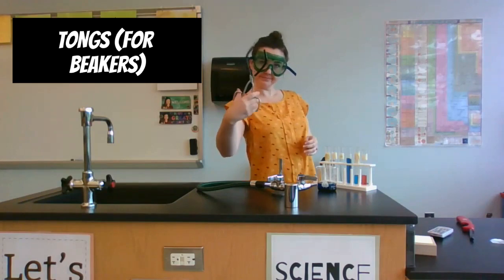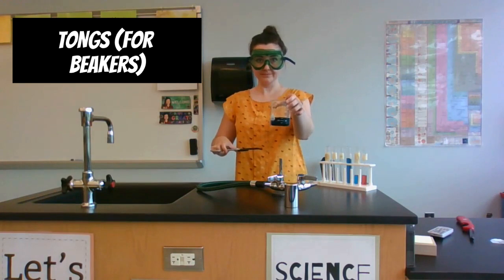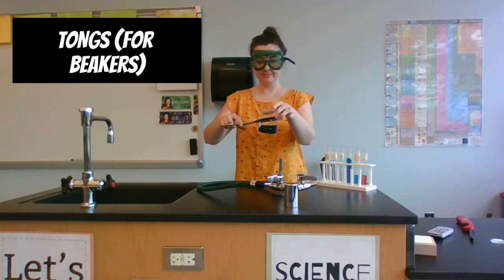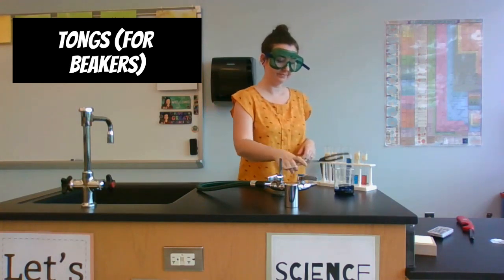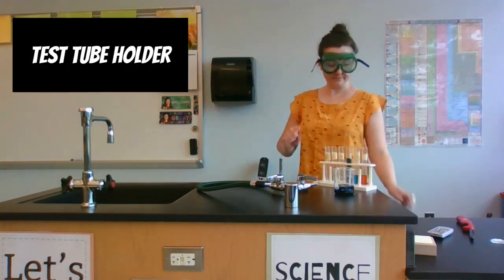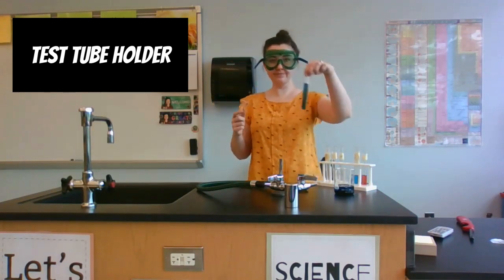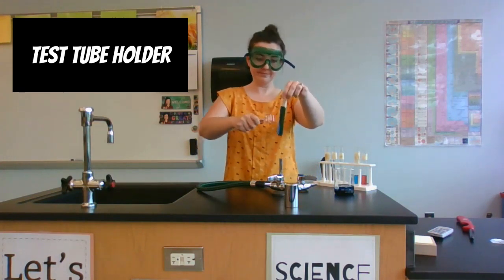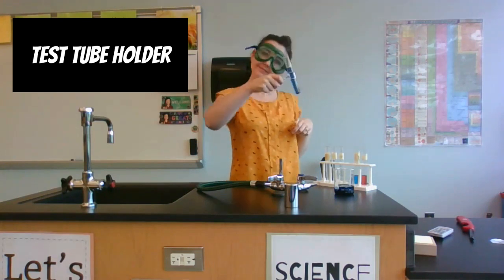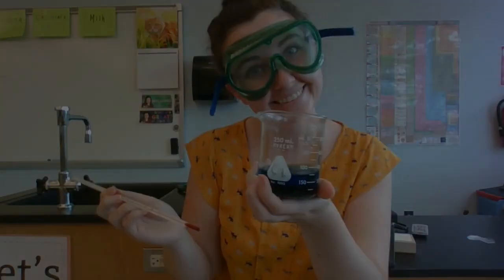The Bunsen burner provides a continuous flame. This tool is called tongs — I can use it to hold a hot beaker. Sometimes we have a beaker on a hot plate heating up liquid inside, and we need those tongs so we don't burn our hands. If I have a test tube, I use a test tube holder to take it out of a hot water bath without burning my hands.